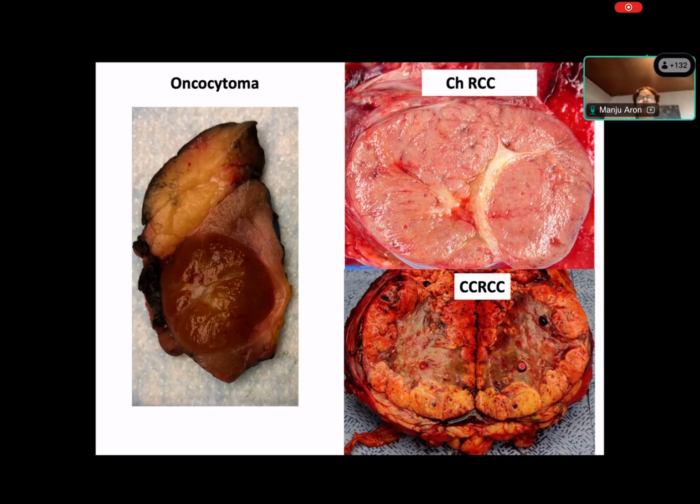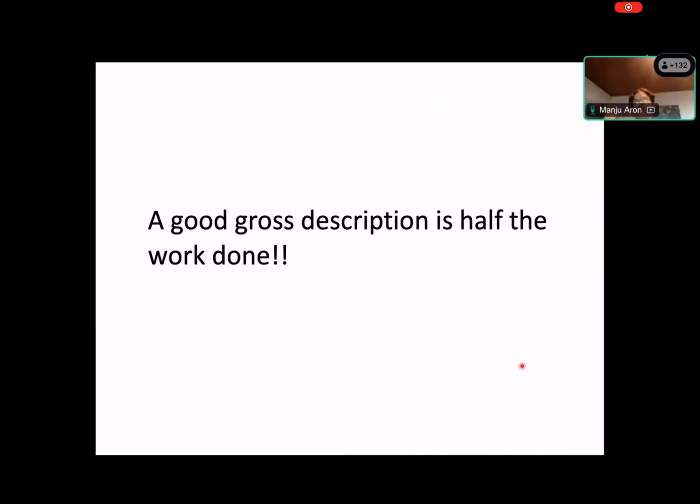So oncocytoma, chromophobe RCC, and clear cell RCC. So, a good gross description is really half the work done.